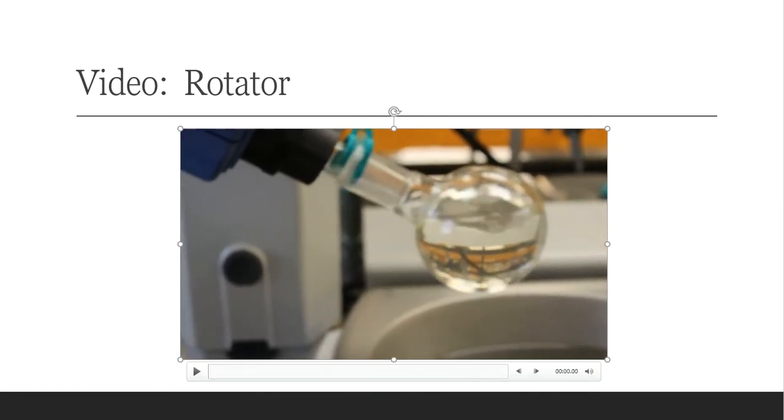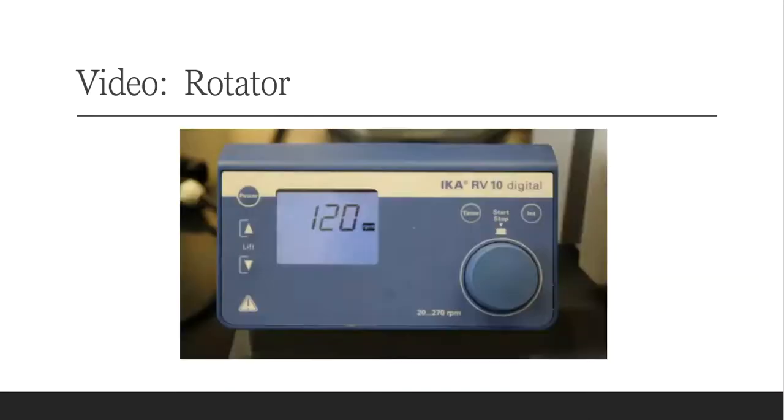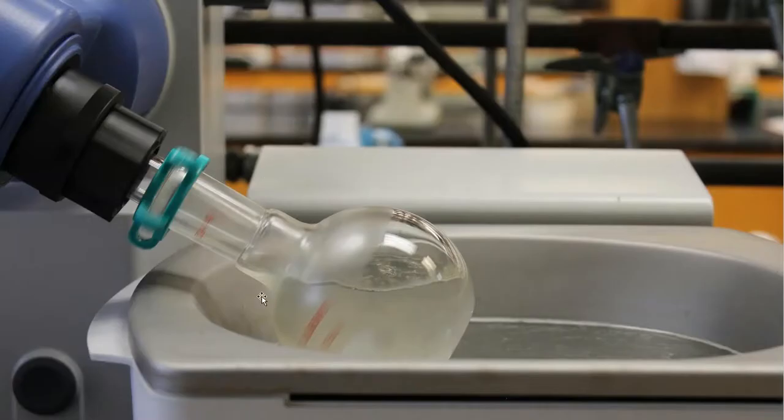Okay, so there's one last thing that I have to do. When this flask begins to turn and begins to spin, I need it down in the water bath, don't I? And right now it's just sticking out in the middle of the air. So how on earth do I lower that flask down into that water bath?